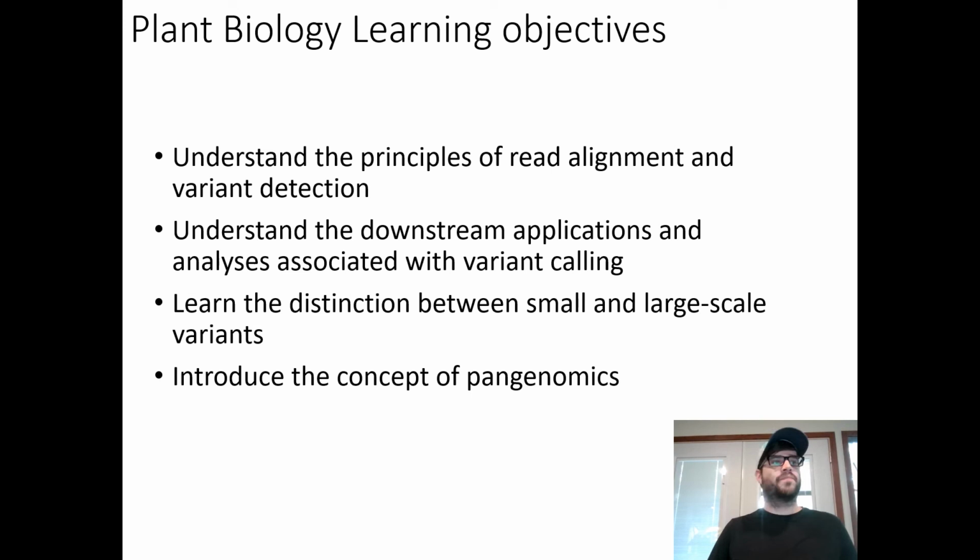And so hopefully this provided you some introduction, and for the rest of this lesson, what we'll be doing is we'll be importing a VCF file, doing some filtering, and doing some basic hierarchical clustering and principal component analysis on some data from grape and some data from pineapple. And again, this is just an introduction. You can do lots of downstream analyses from this as well.